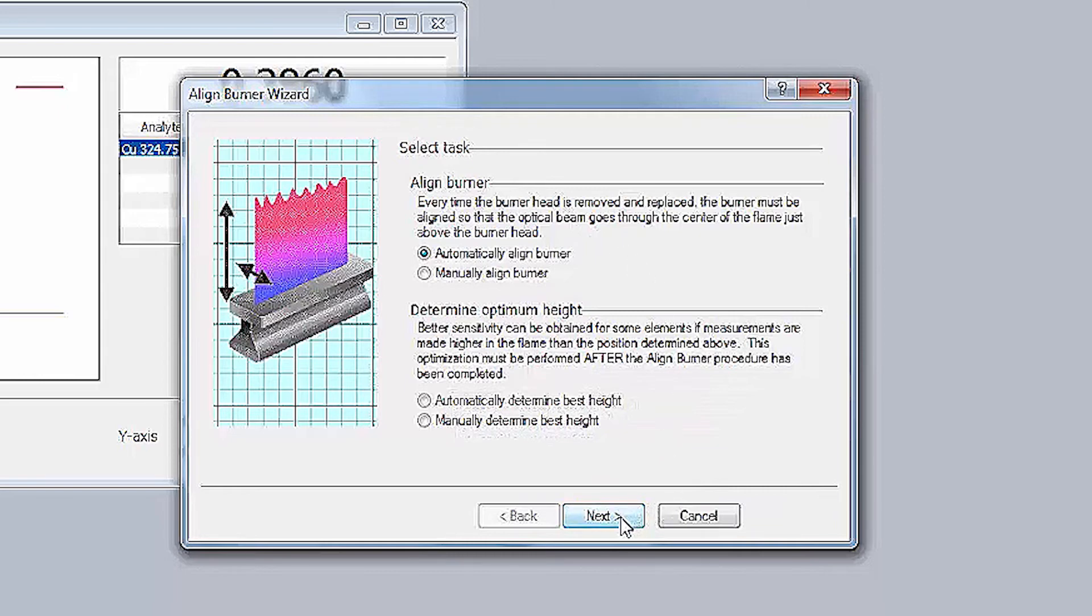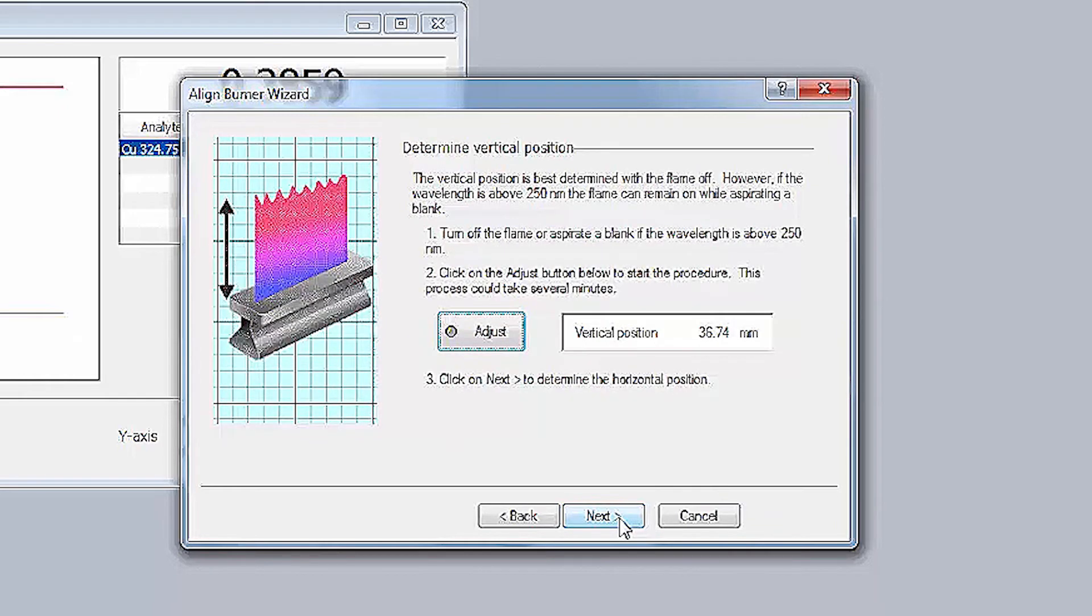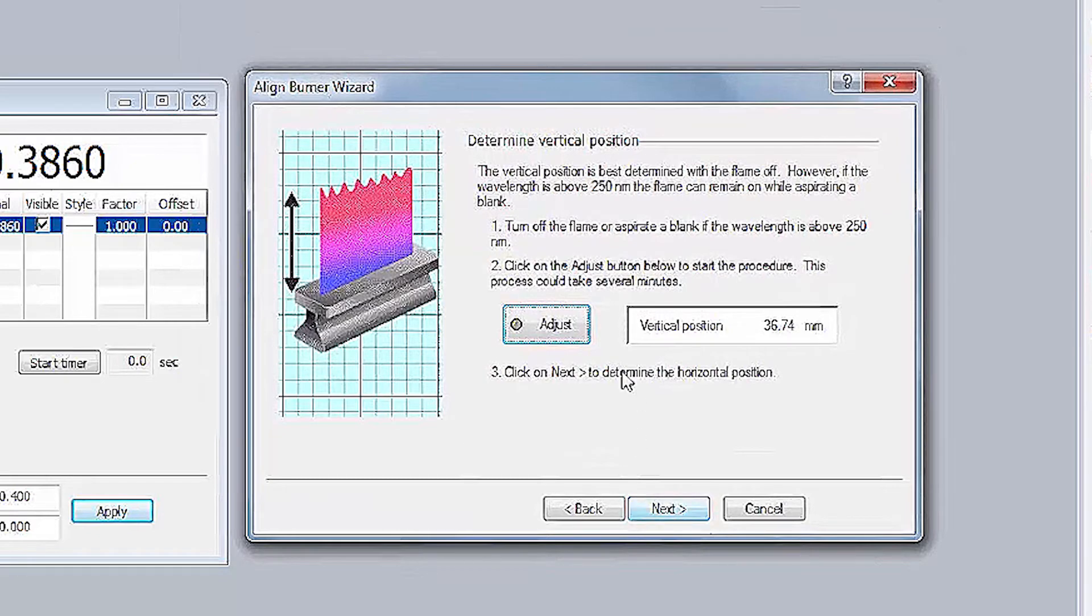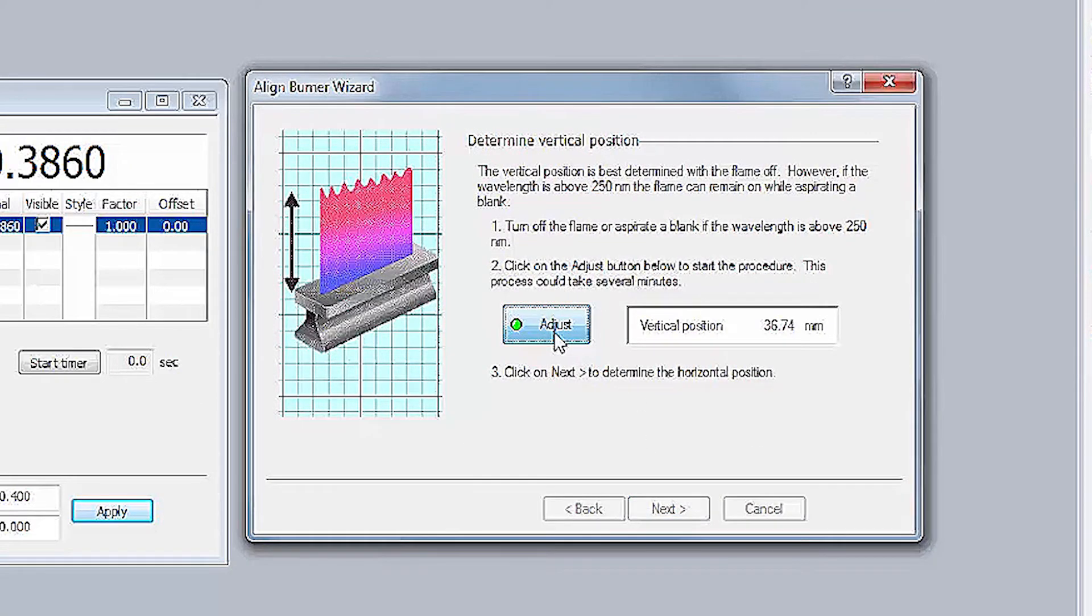Click Next to start the Auto Alignment Wizard. As you can see here, the Alignment Burner wizard first guides you to align the vertical position of the burner. As indicated by the wizard, this position is best determined with the flame off. Click on the Adjust button to automatically align the burner's vertical position.